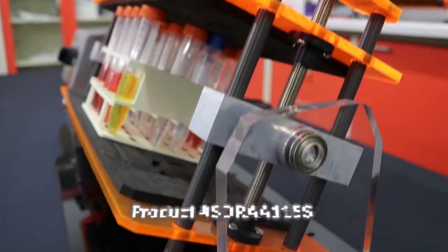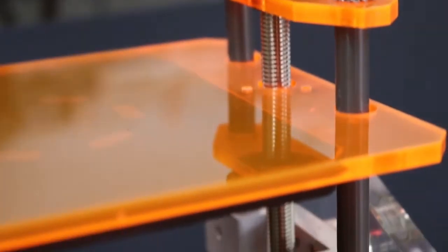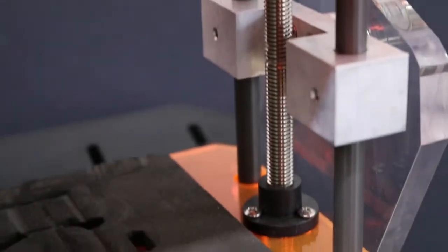IBI Scientific's lead screw design of the platform makes certain that no matter what size tube rack you secure in the Spin Doctor, the load is always centered.